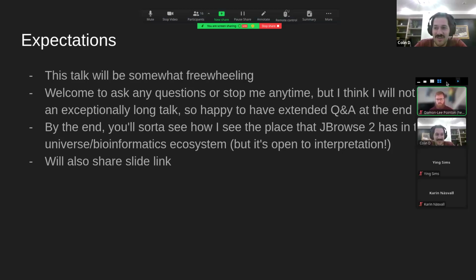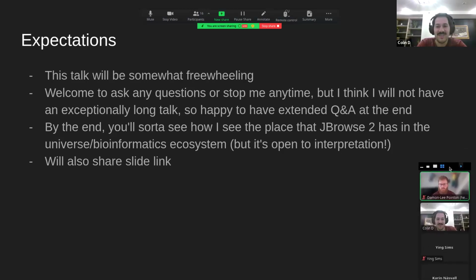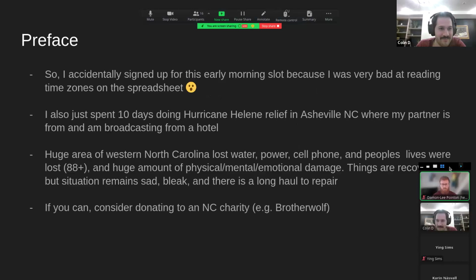So you're welcome to wait till the end, and we can do any extended Q&A. By the end, you'll see how I see JBrowse2 in its place in the bioinformatics ecosystem. And I'm happy to share any slides and further content.